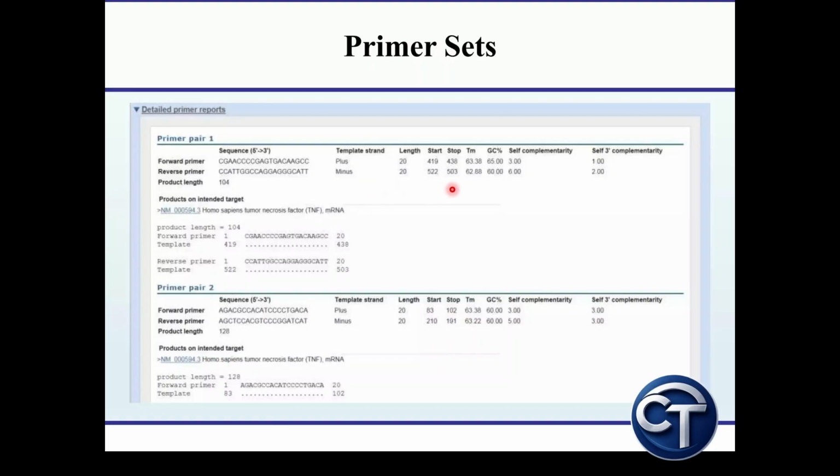So this was all about designing in silico primers, and this method saves time compared to manual design, reduces experimental errors and improves specificity and efficiency. But the limitations are that the software predictions are not always perfect. Experimental validation is still required.